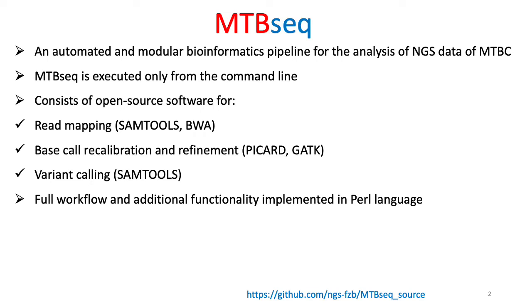for base calibration and refinement, MTBseq uses PicardTools and GATK, or Genome Analysis Toolkit, and for variant calling, MTBseq applies SAMtools, with the full workflow and additional functionality implemented in Perl.